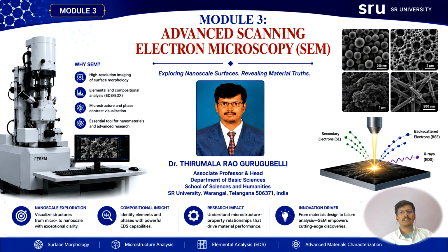In this video, we will discuss an advanced characterization technique for materials characterization. One of the most advanced characterization techniques is scanning electron microscopy. Scanning electron microscopy is commonly known as SEM. In this video, we will explore one of the most powerful characterization techniques used in material science, nanotechnology, physics, chemistry, and engineering research.